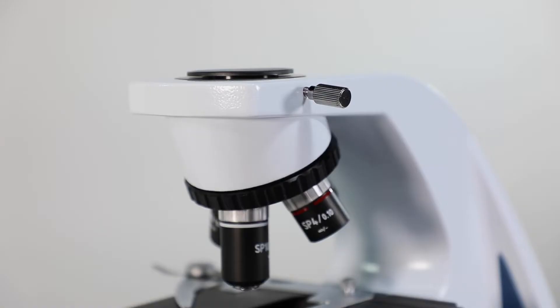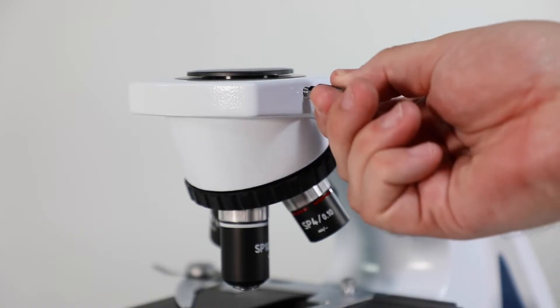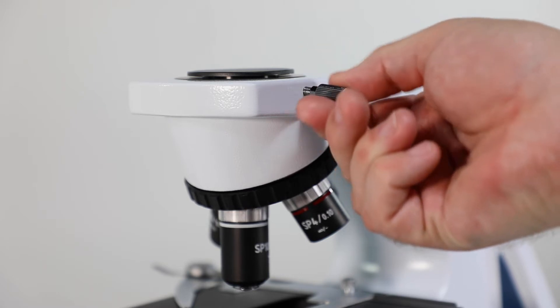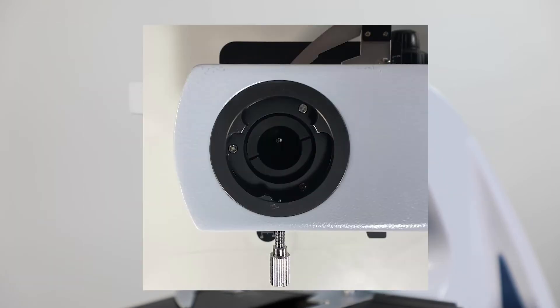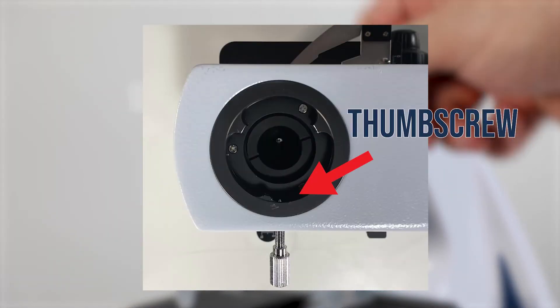Let's move on to installing your microscope head. Loosen the thumb screw on the body of the microscope and remove the plastic cap revealing the head port. Make sure that your thumb screw is loosened enough to be flush with the inner wall of the head port to avoid issues with installation.